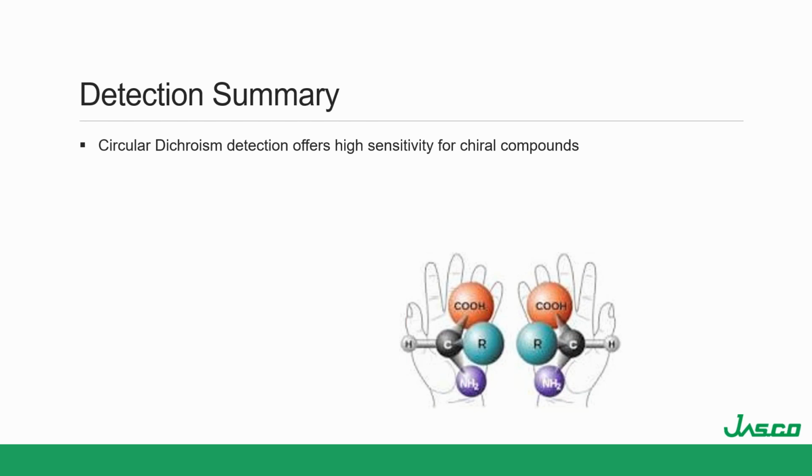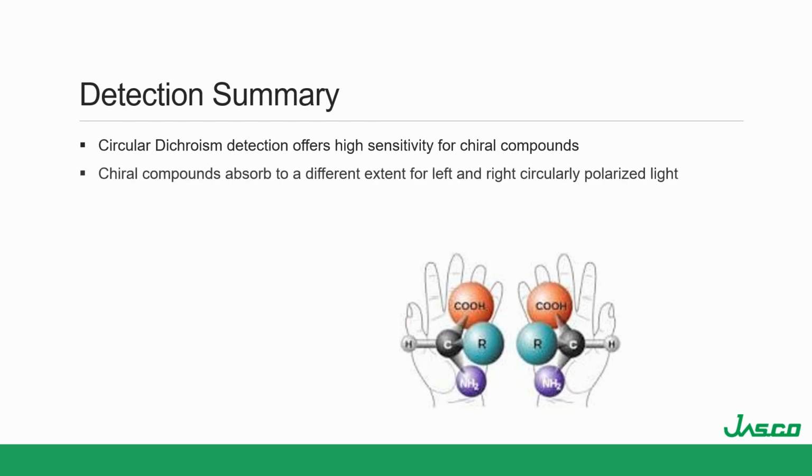After this, the FDA mandated chiral testing, and companies then had to figure out how to address this. You can address the racemization one of two ways. You can let the racemization take place and then use preparative chromatography to remove the unwanted compound, or you perform a stereosynthesis to produce only one. Typically, one of these methods is more cost effective, and which one depends on the compound. But either way you look at it, the resulting batch will need to be tested for enantiomeric excess, or EE.